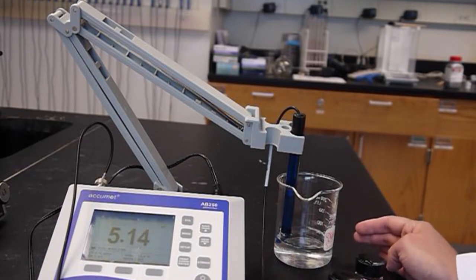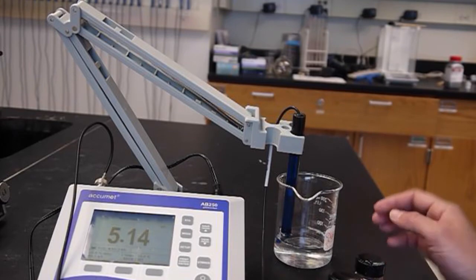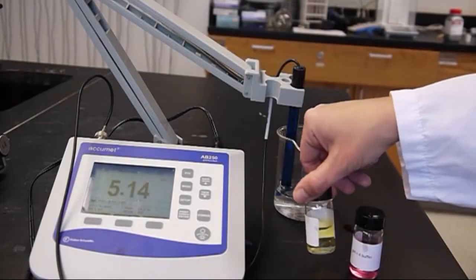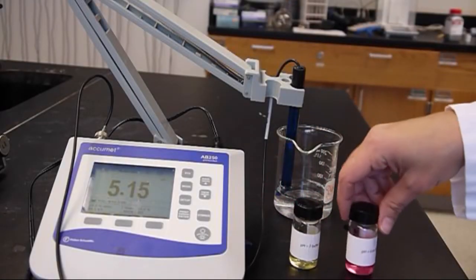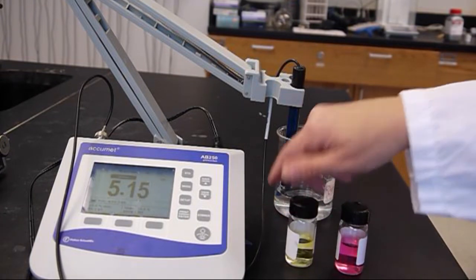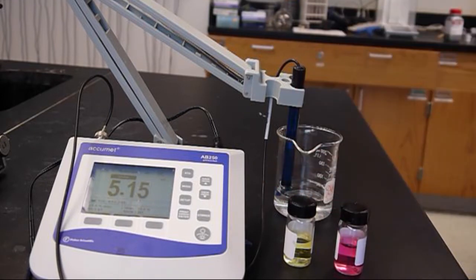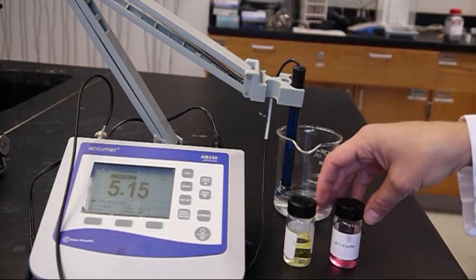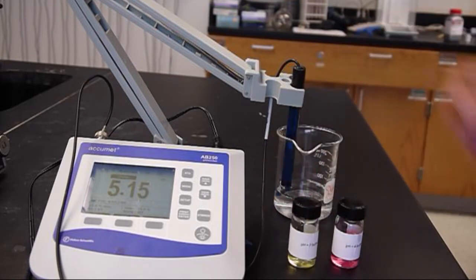So before we run a measurement we need to calibrate our pH meter. We're going to use pH 7 buffer and pH 4 buffer for our calibration. These are colored solutions. They have a dye in them so it makes it easy for determining which is which so you don't get them mixed up. That's all that's really there for.